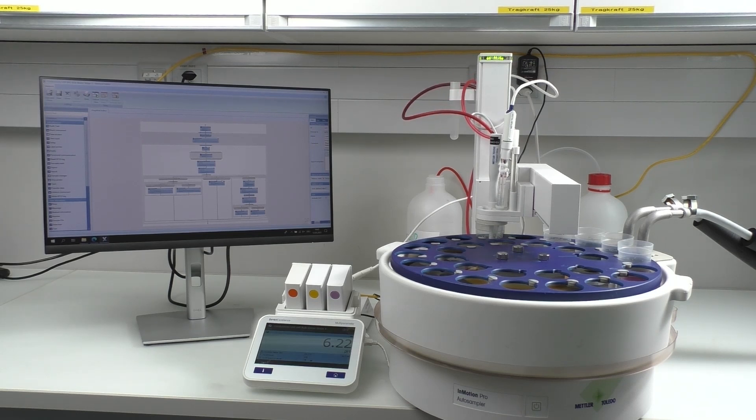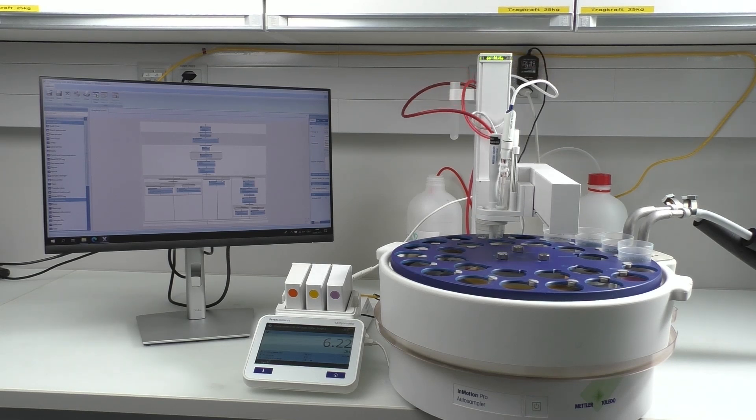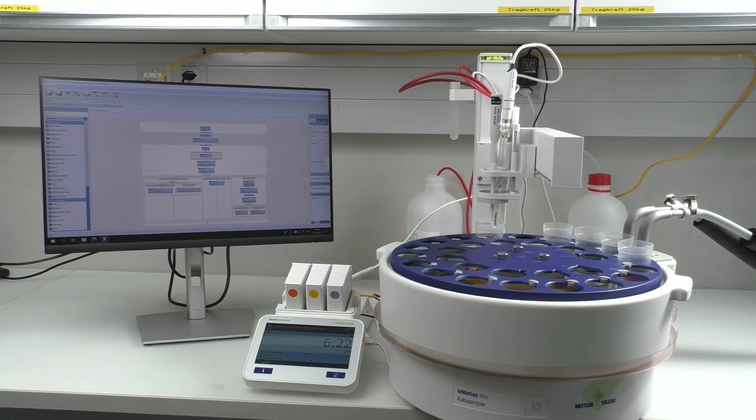According to the conductivity value from stage 2, we expected a pH result of 6.9, but our value is 6.22, so we failed stage 3.